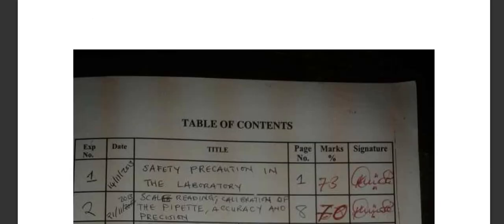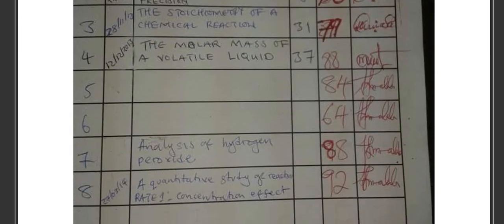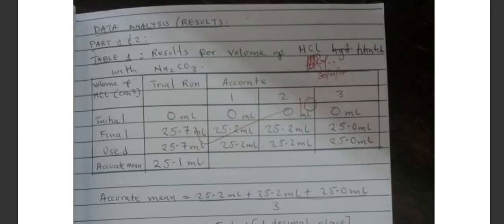So we're going to go to experiment number 5, which is your back titration. Come to the screen. Okay, just a minute. Yeah, so like I was saying, these guys know that you do copy and paste when it comes to instructions, the summary, the title, everything else. You do it as a group, or if you have a lab partner, they know you always have a way to work around the discussion, the qualitative part when it comes to the description of what happens in the experiment. So here now we want you to give us the quantitative part by you doing the data collection and the calculation. So this is from what I was explaining, from the procedure that they're going to give you.